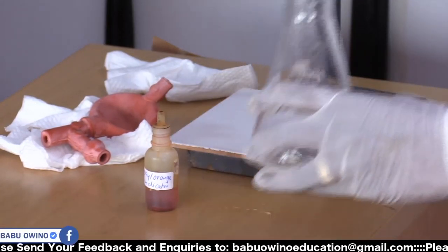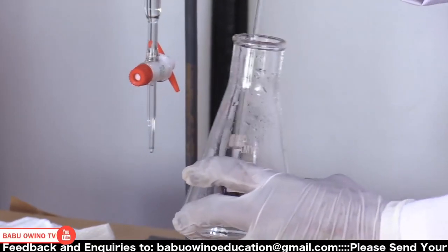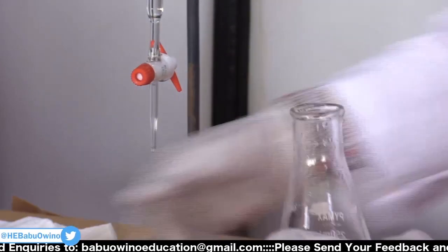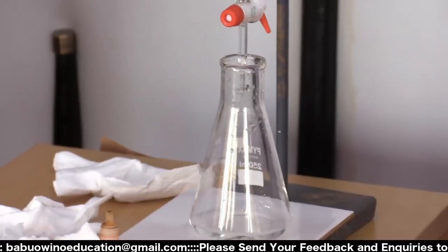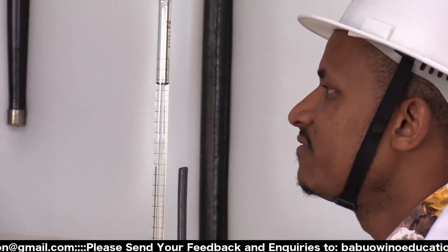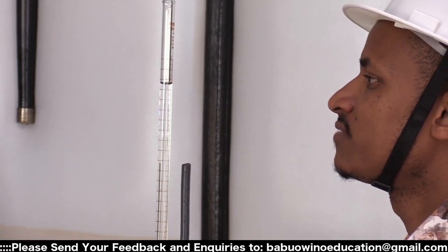Once again, when it starts doing that, you just tap the sides of the flask. So we'll move a little bit faster to save time. Then before that, we read our initial value. Our initial value is 2.5. To two decimal places is 2.50.